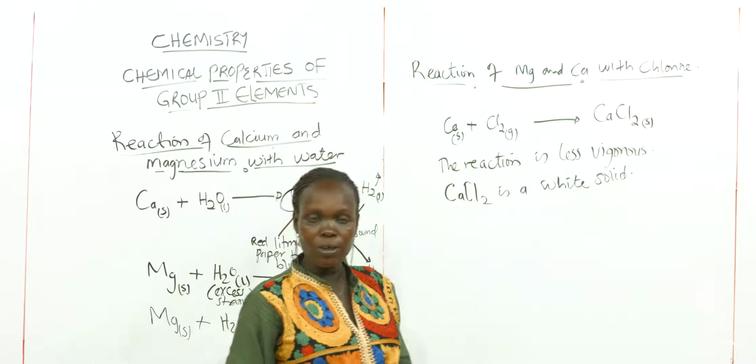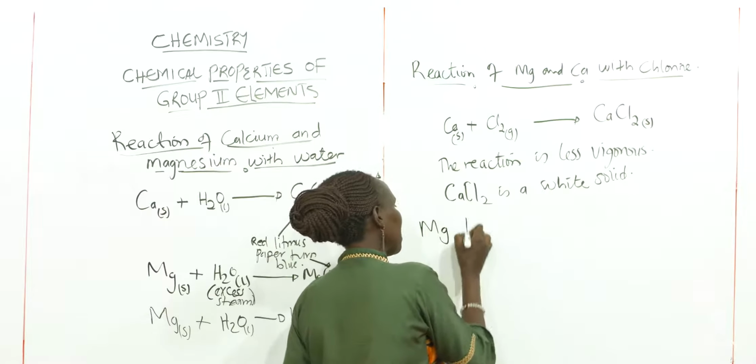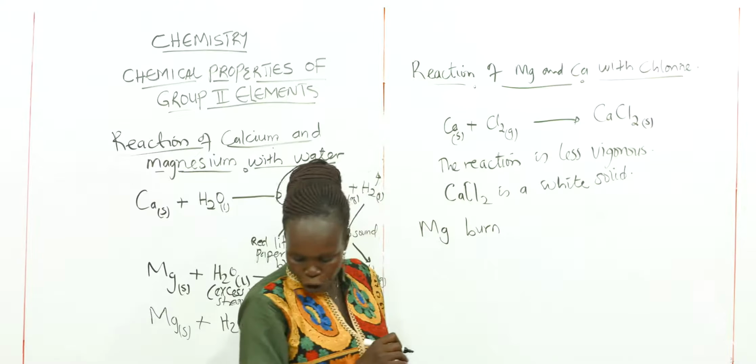So here we are going to see that magnesium burns in the presence of chlorine.